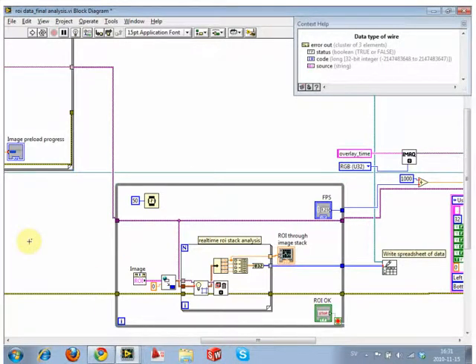I think you can never do that in LabVIEW, connect two data, because what is then the outcome? Yeah, but like I'm saying, you can connect them as long as you specify how to. Like you can add these together as an array. You just build an array and stick the two together. That's fine because it now knows how you want to add them together. Just adding them together means nothing. You can't just ram two data together.